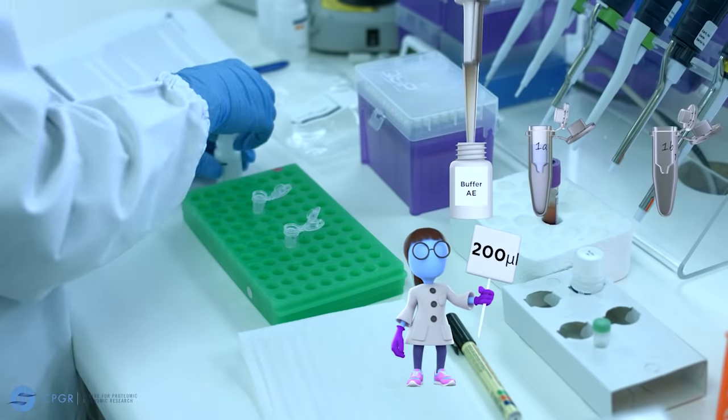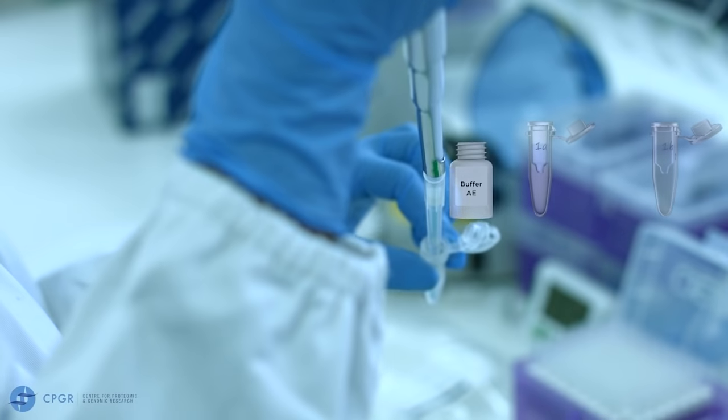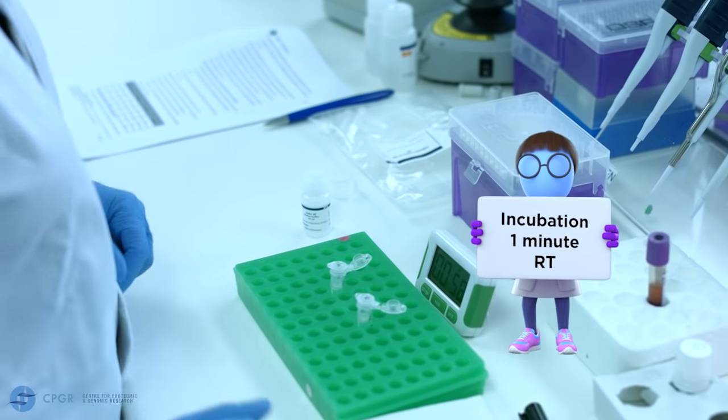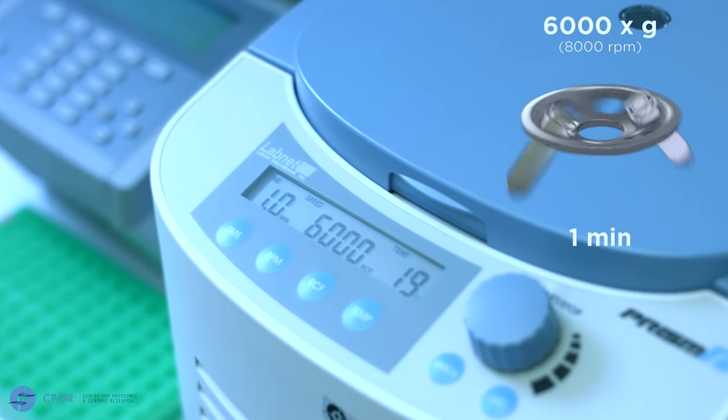Add 200 microliters of AE buffer to each spin column, remembering to change tips between samples. Incubate for one minute at room temperature. Centrifuge for one minute at 6,000 g, that's 8,000 rpm.